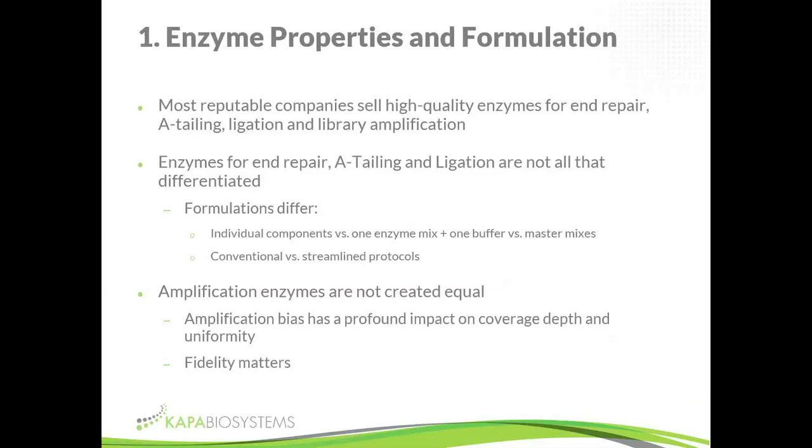In the same tube, you need an enzyme that efficiently amplifies long and short molecules, GC-rich and AT-rich molecules, and molecules with complicated secondary structure and not, all at the same efficiency. Whatever you had at the end of ligation, your population of unique fragments, you want to copy all of that to the same extent so that you retain your coverage uniformity. During the PCR step, enzymes that are more biased will preferentially amplify the easy molecules, the short ones and the ones with balanced GC content. That's where the population starts being skewed, and this is where your issues with coverage uniformity start.